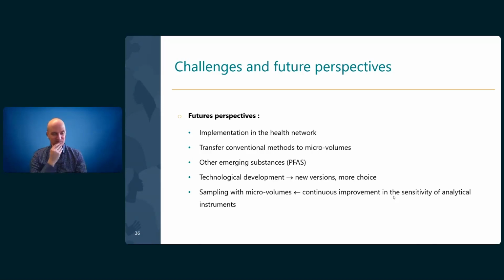And I'm very confident that the continuous improvement of instrument sensitivity will allow more developments in microsampling. The microsampling development will benefit from the improvements in instrument performance. So this will really help to have new developments for microvolumes.